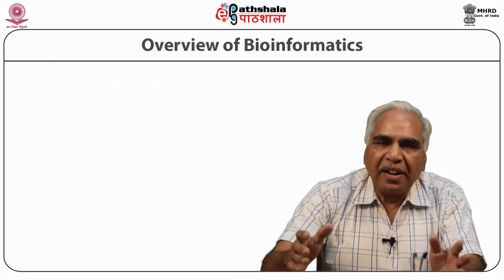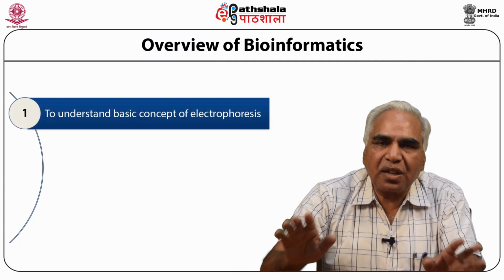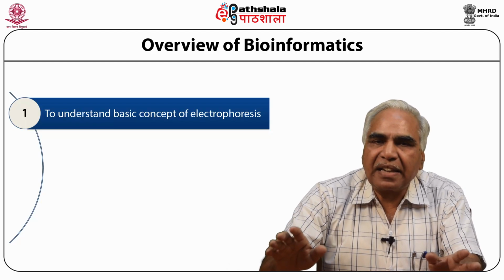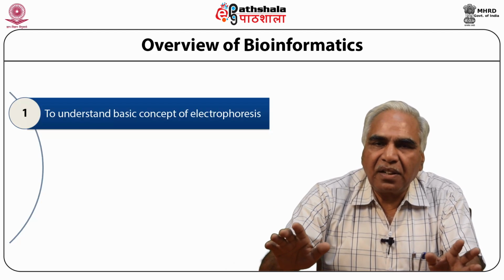Fundamentals in any technique should be very clear because this can help in solving many of the bench problems. In this presentation, our focus will be on understanding the concepts relevant to electrophoresis technique, which deals in movement of charged particles in an electric field.